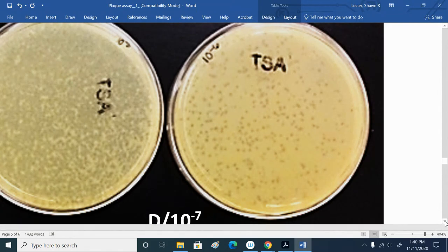Yeah, so when you have a lot like this, what I suggest doing is count half of the plate. So draw an imaginary line, for you guys. In real life, you could actually take a Sharpie and draw on the bottom in half and start counting, because if you reach 150, you know it's going to be too many, right?